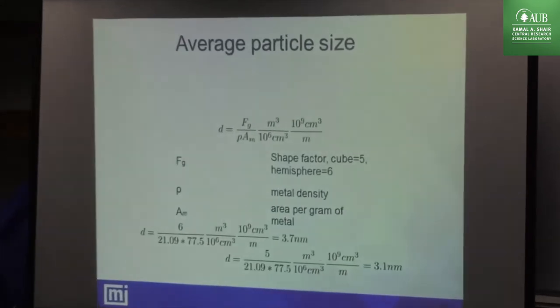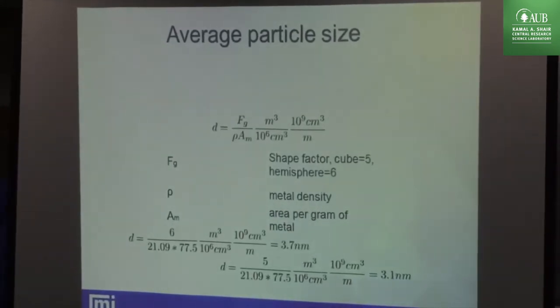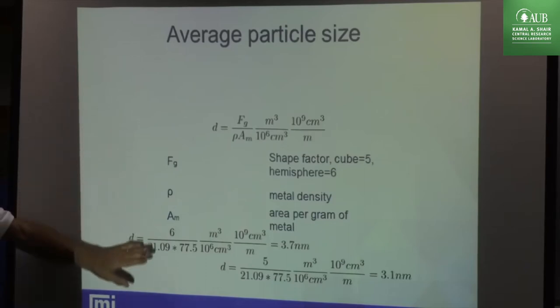So if your D is increasing, it means you are sintering your sample, and you have to avoid it. And this is the temperature. Really, what is causing the sintering is that temperature causes the vibration of the molecule or the atom, sorry, and it can sinter very fast. So this is important information. This we can do in maybe 2-3 hours, very fast, in the chemisorption.